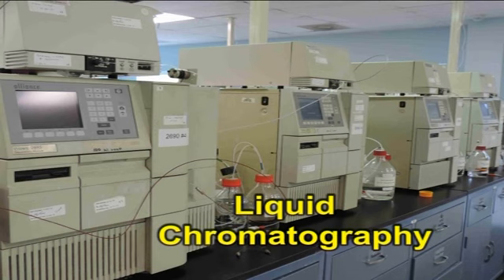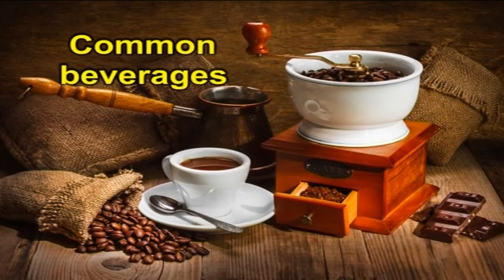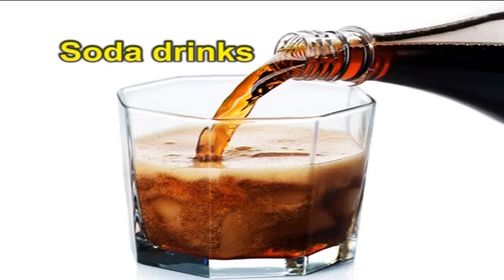A wide variety of methods have been employed, with high pressure liquid chromatography being the method of choice in many analytical studies, as it is commonly subjected to fewer interferences than alternative methods. HPLC is an expensive and laborious technique that is not typically found in the scientific teaching labs of schools and colleges. Therefore, this application note will investigate an alternative analytical method that uses UV spectroscopy to analyze and quantify the caffeine content of some common beverages and soda drinks.